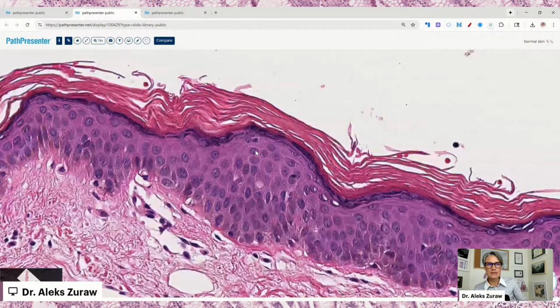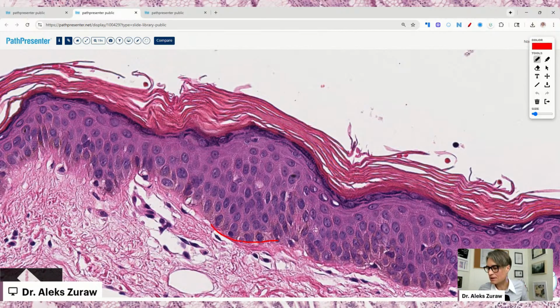An epidermis, this is our barrier. This goes from the base of this epidermis. At the base there's always a membrane, right? So there's going to be a basal membrane, and going to the outside, we're going to have this keratin layer, a layer of dying/dead cells that constitute an additional protection layer. This is going to be stratum corneum.